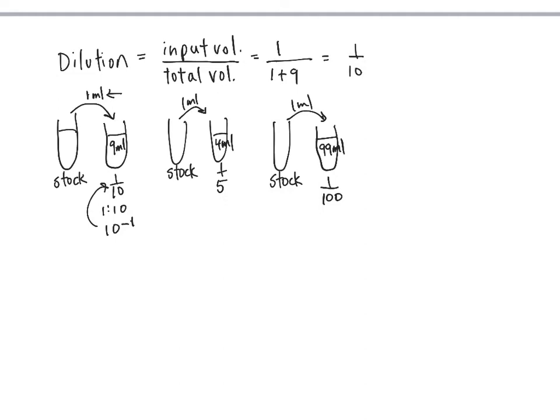But in our case, in lab, we only need 1/10 of a mL of this, so we're going to be wasting all sorts of media. We don't want to do that. We could take out 0.1 mL and put it in 9.9 mL, that's 0.1 divided by 10, which is the same thing as 1 to 100. Okay, but what we're actually going to do is make some serial dilutions.